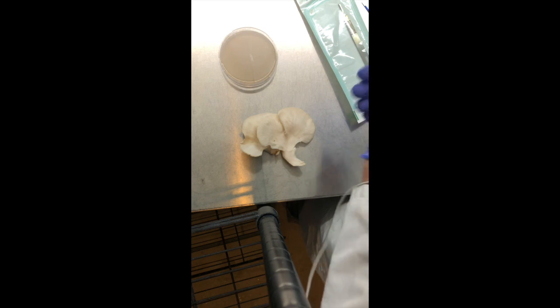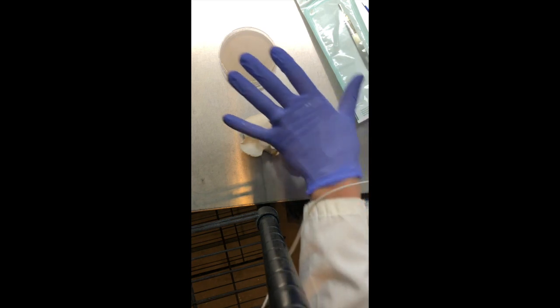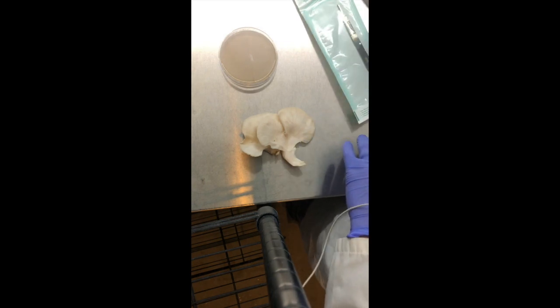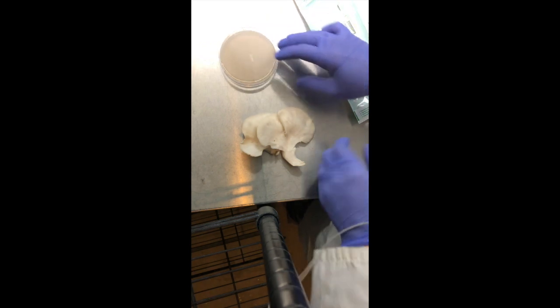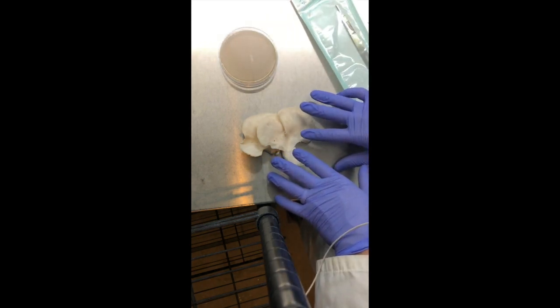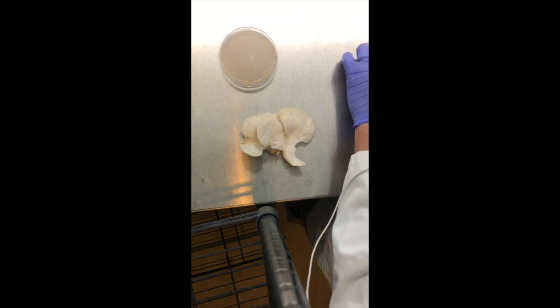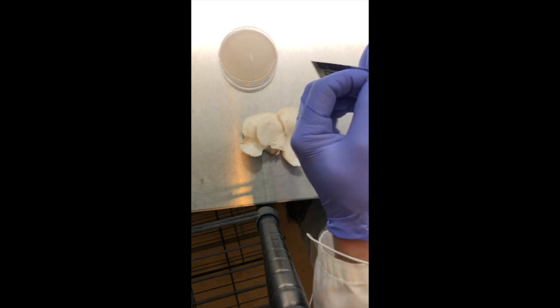I apologize about the audio — something was happening to my microphone. So I'm going to go ahead and walk through this with you. Right now I'm displaying the agar I'll be using, which is malt extract agar, and then the fresh tissue from the elm oyster that I'm going to be cloning.